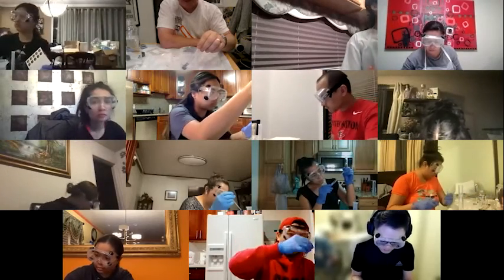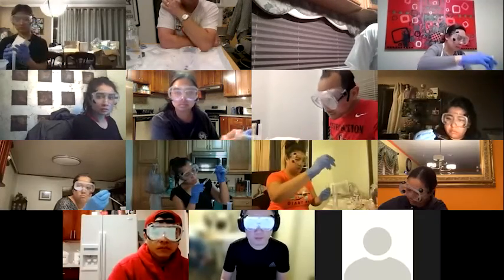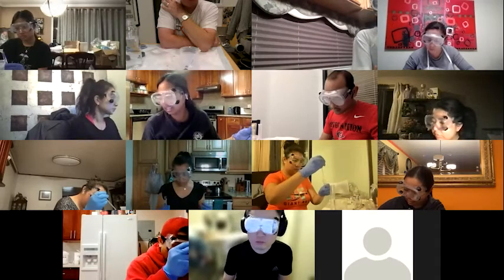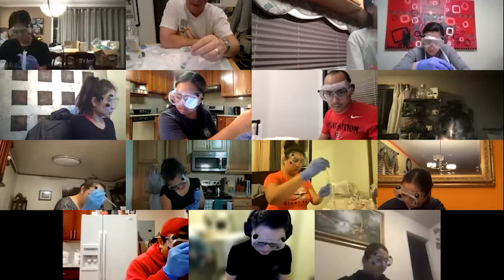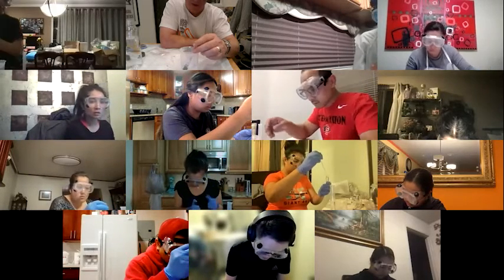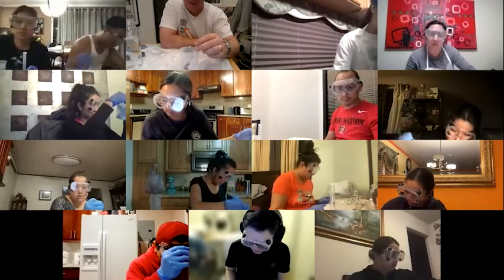So this should actually work. This is looking great. It's almost full of hydrogen by now. Renee, are you seeing the bubbles around the metal? Just very little. Give it some time. Whoever was using dilute HCl, is that working? I haven't gotten that far yet. I still have a bunch of metal left, so this reaction's still going. And the tube is almost completely full. I love this reaction. For some reason, it's one of my all-time favorite ones to do.